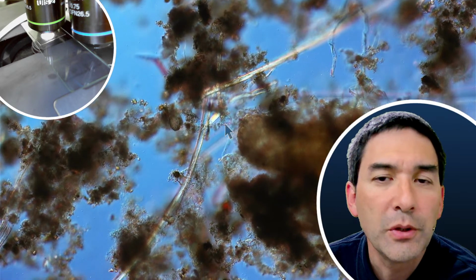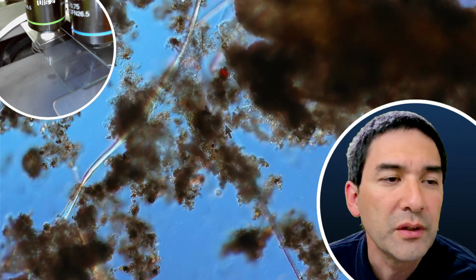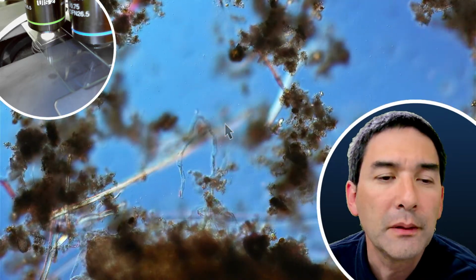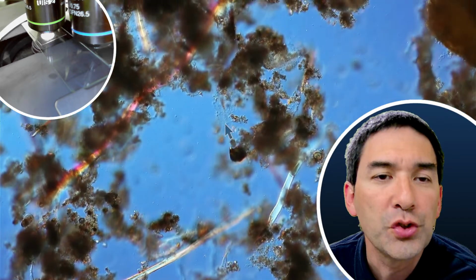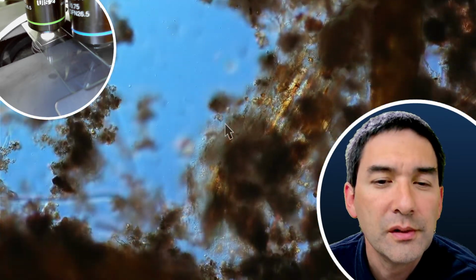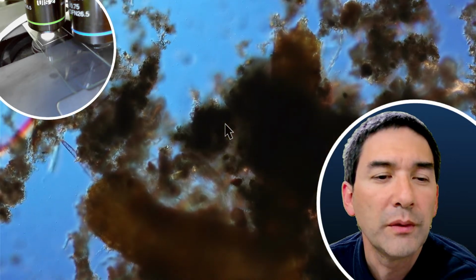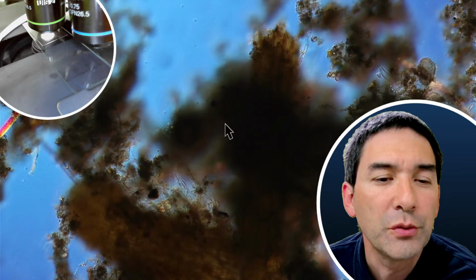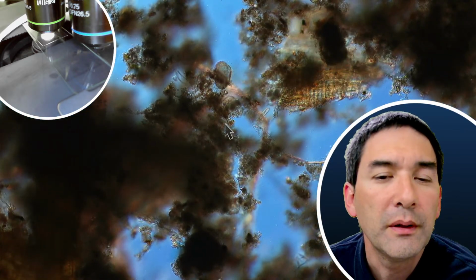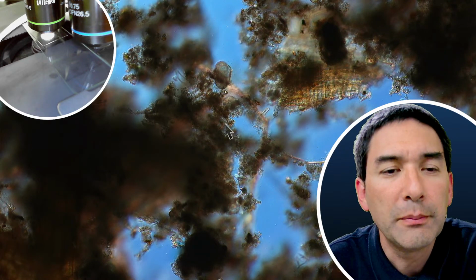Moving cells here, because I would have expected that those that are present would have reproduced, or they're simply too small. Bacteria are certainly present, but maybe not in a sufficiently high concentration. Yeah. So let me see here. See, that's one of the examples when the particles are not sufficiently broken up. Again, up here on the top, what appears to be some kind of pollen, plant pollen.